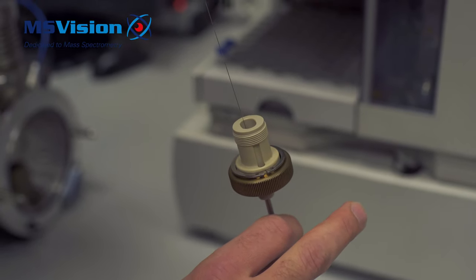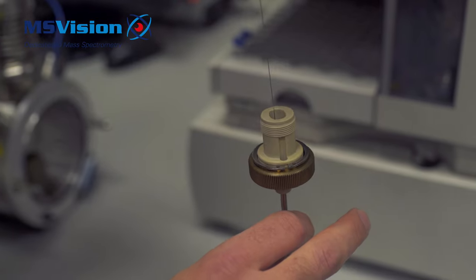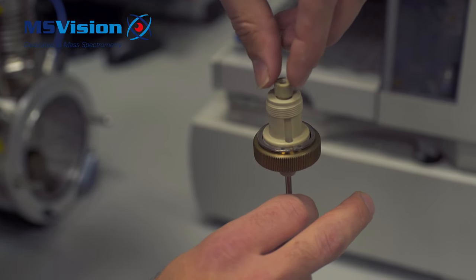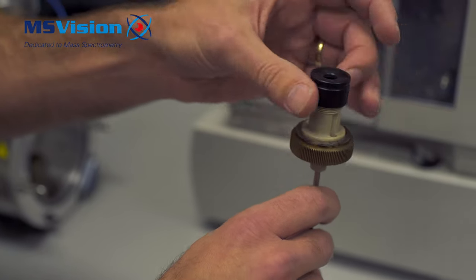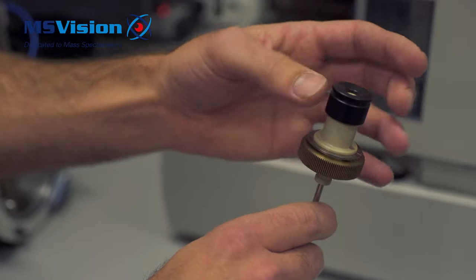Replace the spring into the top of the probe and then reinsert the capillary into the probe, being careful not to bend the capillary. Replace the black cap but don't fully tighten it.